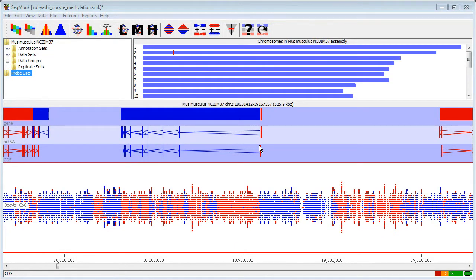In this video I'm going to demonstrate one of the new features that came out in Seatmunk version 0.25. This is a variation on the existing trend plot that we used to have in the old versions and still have, but this one is the quantitation trend plot.